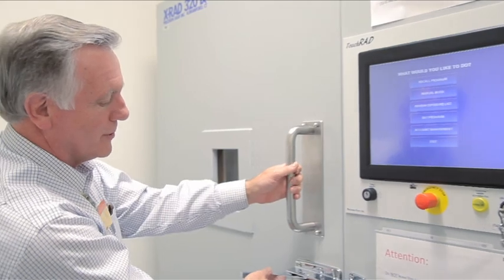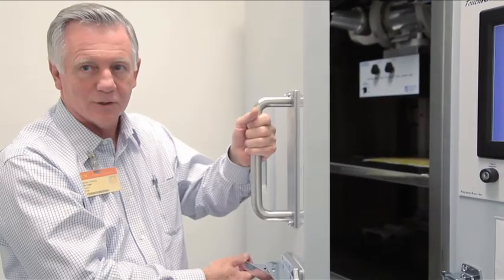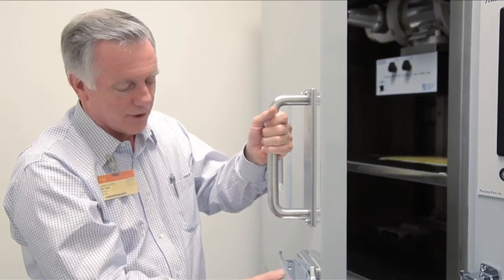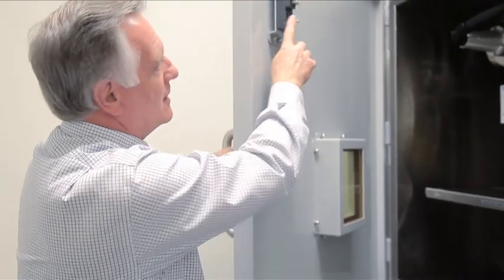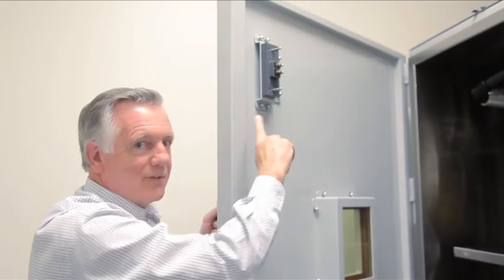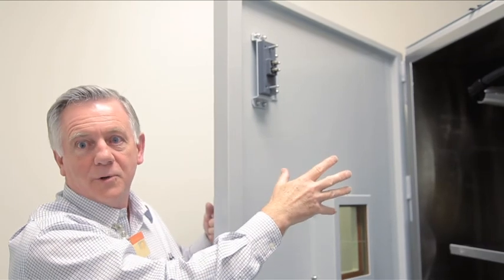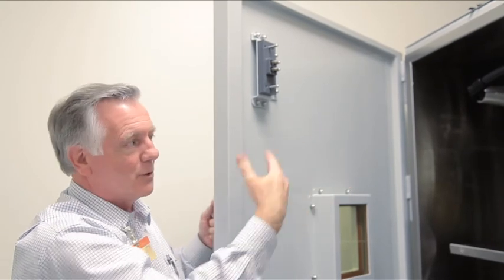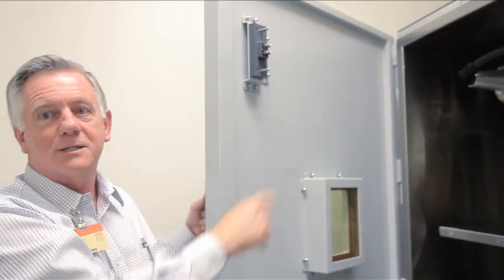Now if we open the door — this is a heavy lead door so it's a good idea to use both handles so you're not putting a lot of stress on the catch. It has an interlock up here. The interlock is for your safety. It will not allow the X-rays to be on when you open the door, so it automatically turns off X-rays if you open the door during an exposure.